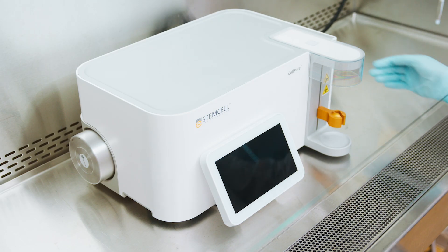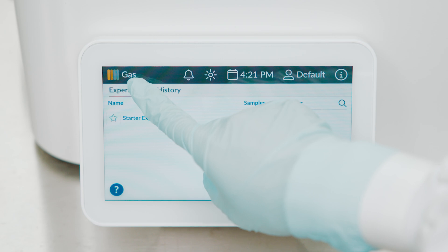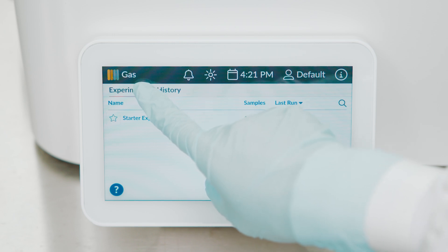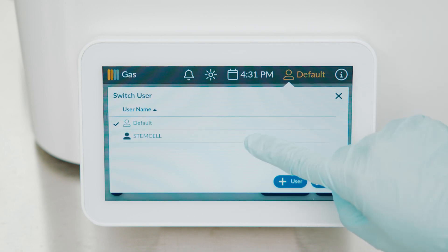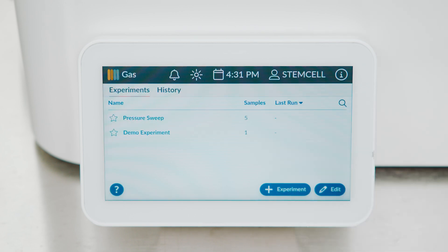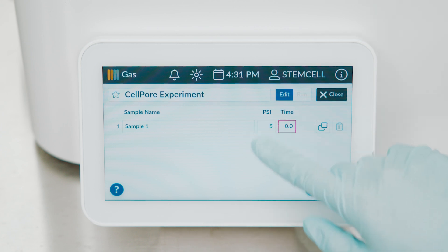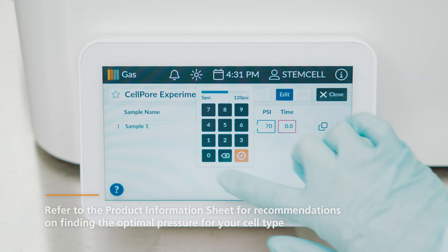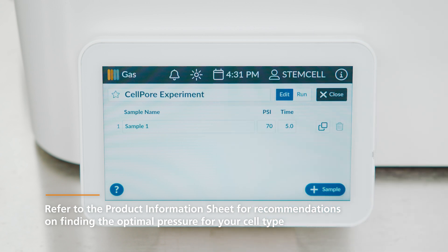Power on the CellPore Transfection System and wait for the system to initialize. Before operating the instrument, confirm that the gas supply is sufficient. The indicator should display at least one bar in order to operate normally. Select a user profile from the control bar. The list of experiments associated with the selected profile is displayed. Create a new experiment by tapping the Add function. In the new experiment window, define each sample by inputting the pressure and time parameters. Refer to the product information sheet for recommendations on finding the optimal pressure for your cell type.